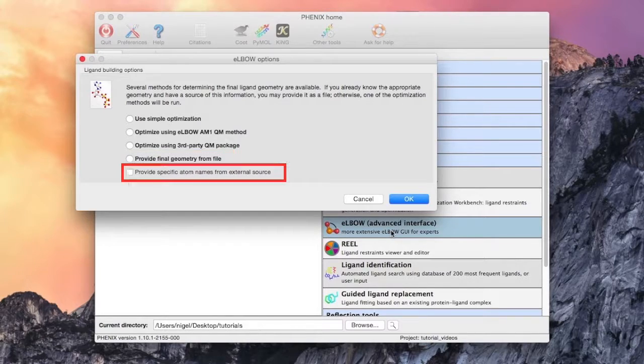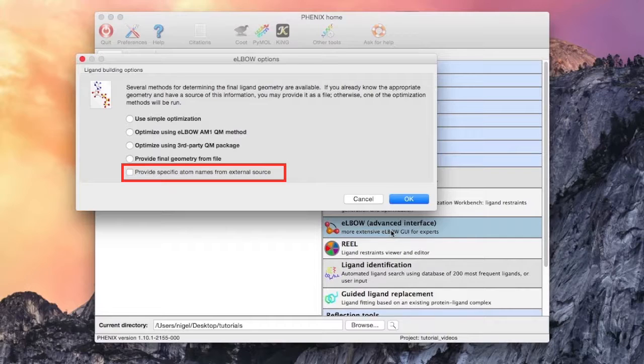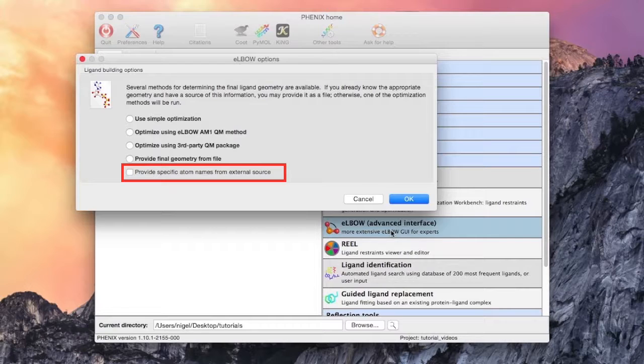This last option at the bottom is related to atom names. This allows a molecule to have the same atom names from another molecule of a similar topology. This is helpful when working with a series of similar molecules.